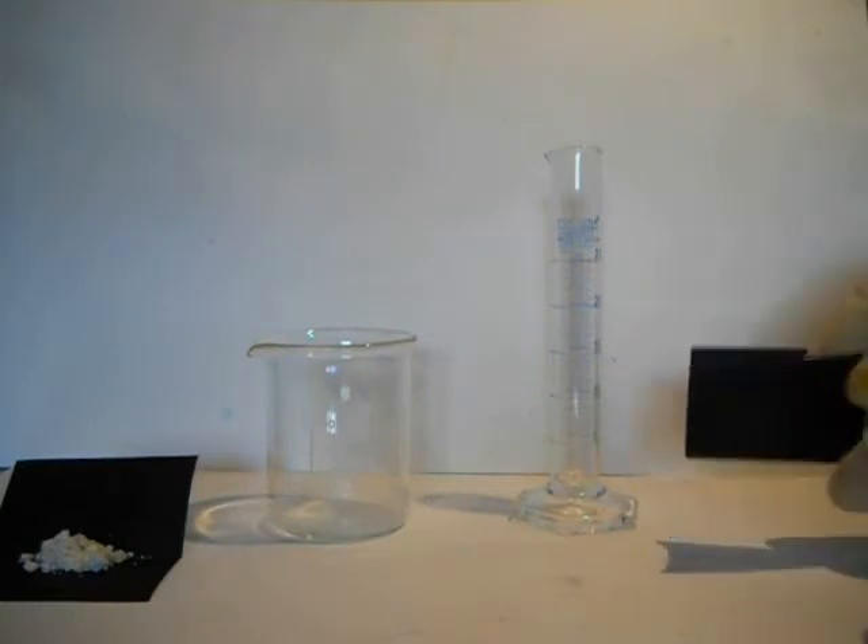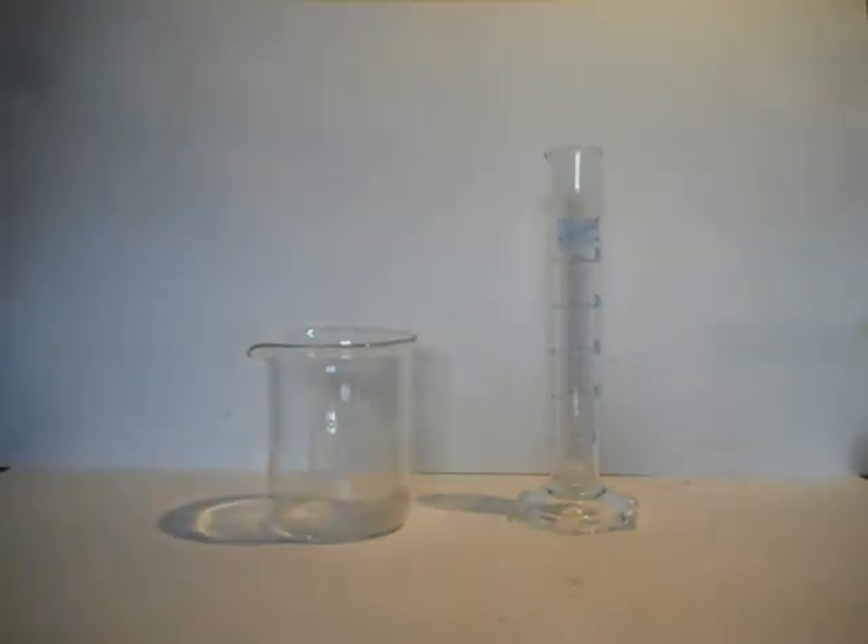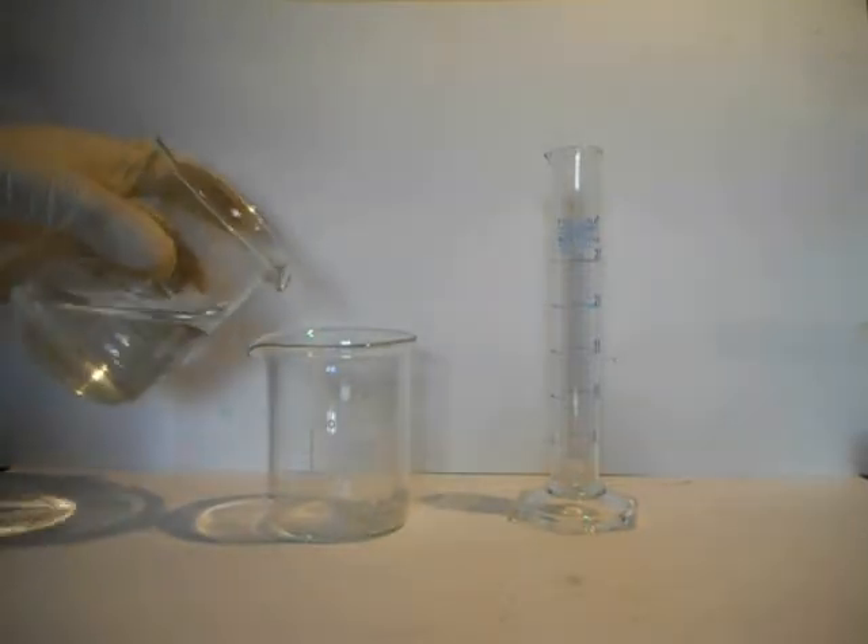To start, I am adding 3.3 g of lead nitrate in the left container, while in the other one 3.3 g of potassium iodide. Then we dissolve them in water and mix until they form a complete solution.